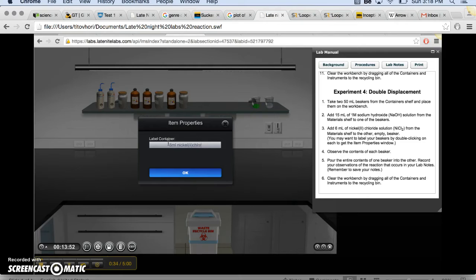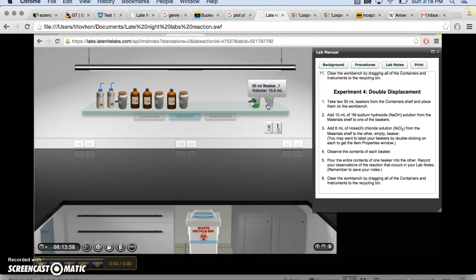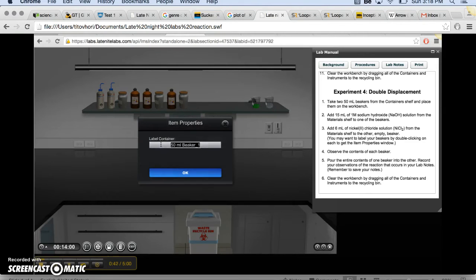It's really important in the lab that we label our beakers properly, because if we mismix our chemicals then we could end up creating a reaction we didn't intend. So as you can see here, we're properly labeling both of our beakers in order to stay safe in the lab.